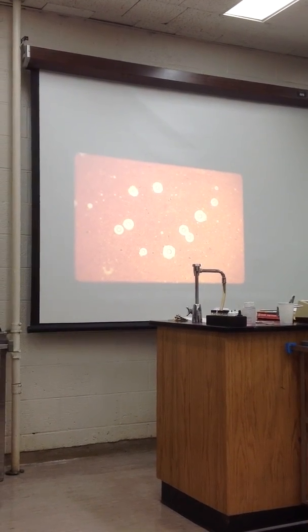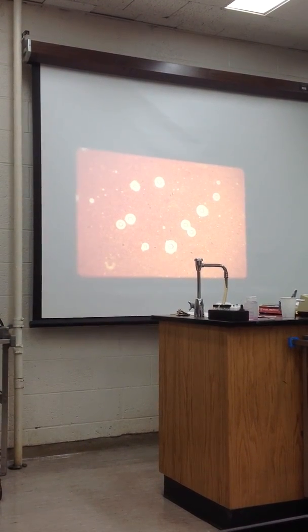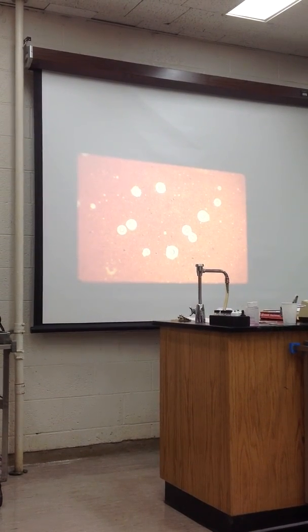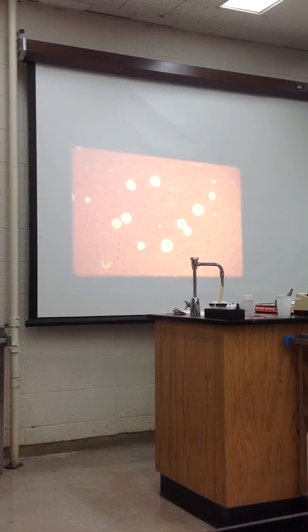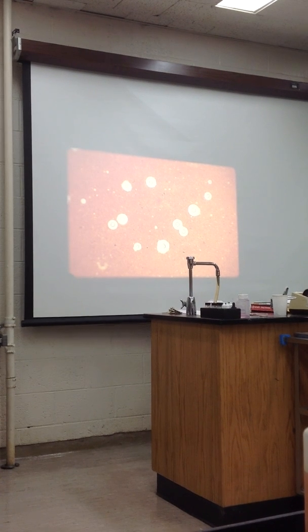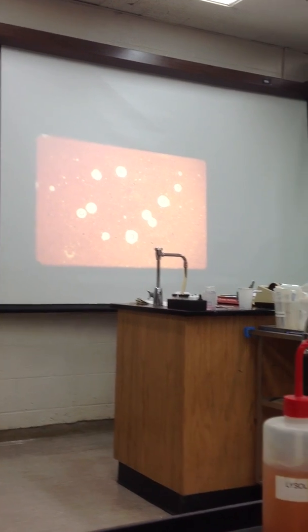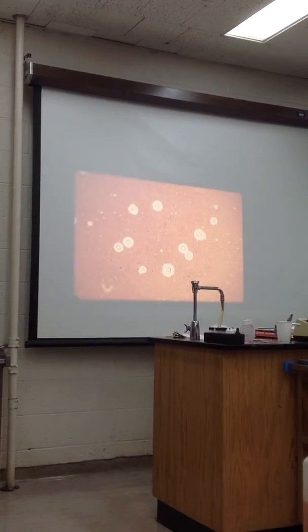That's yeast. Which one is it? Candida albicans? No. Name, identify the organism. Anybody can identify that organism? Go ahead.